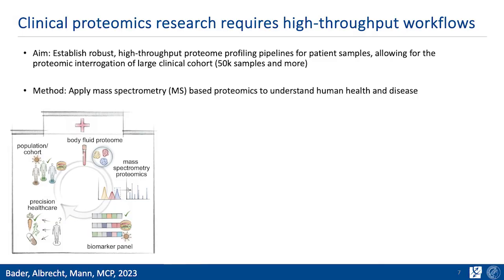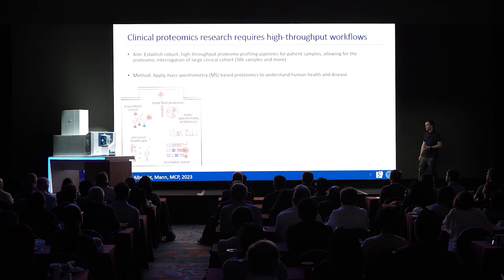And this is quite a common procedure, or it's a reoccurring thing, I would say. So within clinical proteomics or clinical related samples, the most common sample type are some kind of body fluids, so plasma, can also be urine or CSF. And these are analyzed by mass spectrometry, and from these we can gain biomarkers and then hopefully use them for precision medicine or personalized medicine. And in order to do this effectively, we need these large cohort sizes.